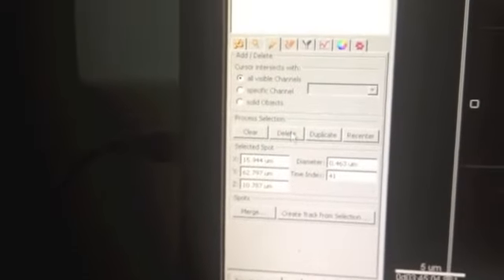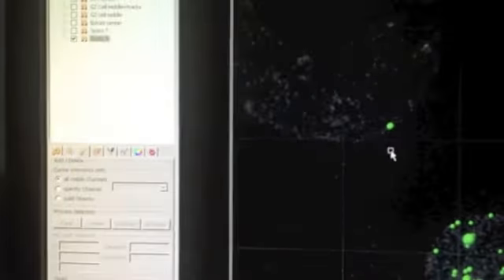Go back to this select button, you can come here, and just by left clicking, you can select the dot. You can then come back here and click delete. You can also hold shift down at the same time, which I'm going to try and do with not enough hands. Okay, so you can hold down shift. You'll then be able to actually delete it automatically just by left clicking on that dot.